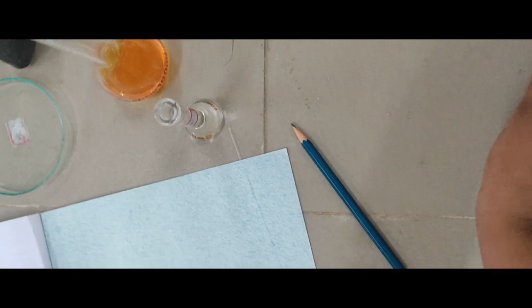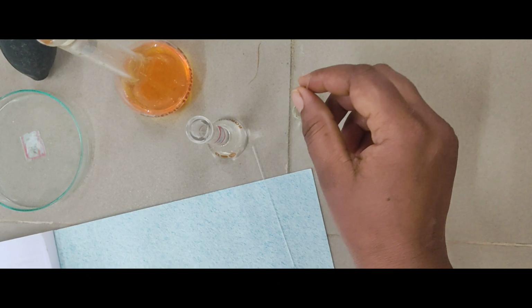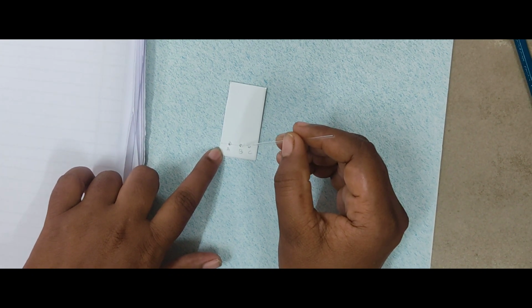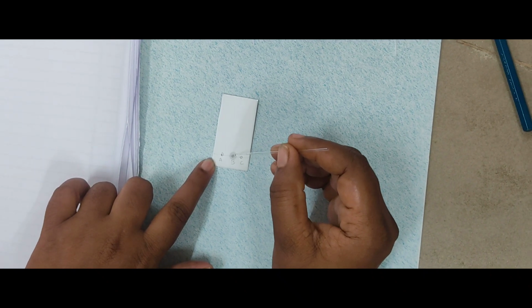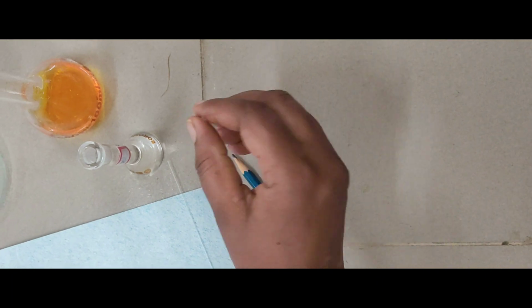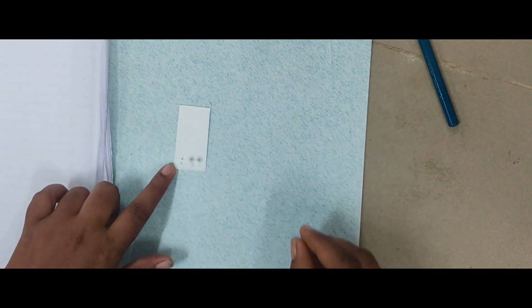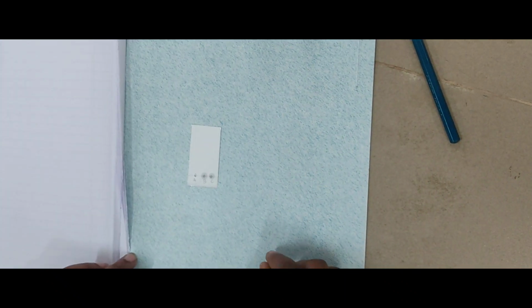Then draw the test sample and place it on the TLC plate using the capillary tube. Place 1 drop in circle B, and again 1 drop in circle C. After completion of spotting, we have to air dry them.